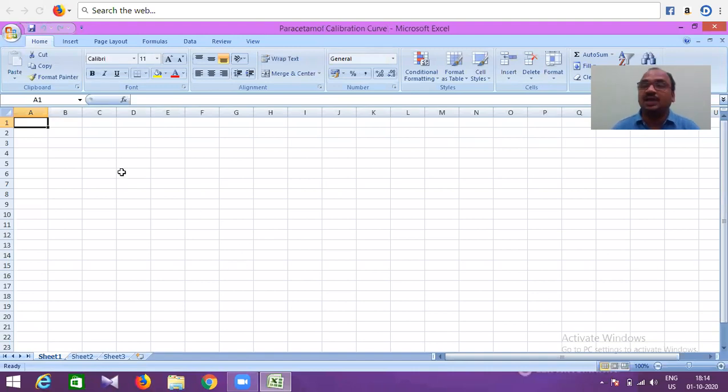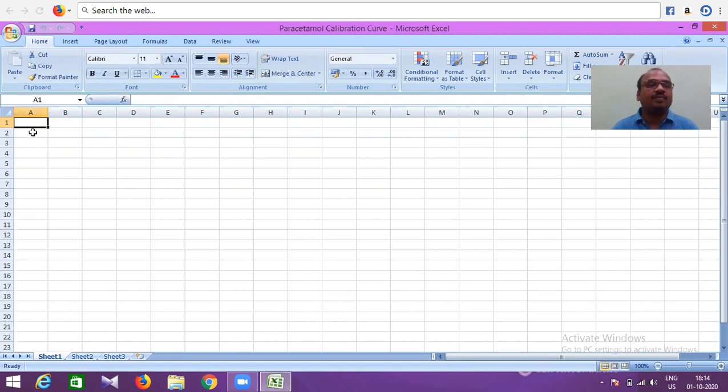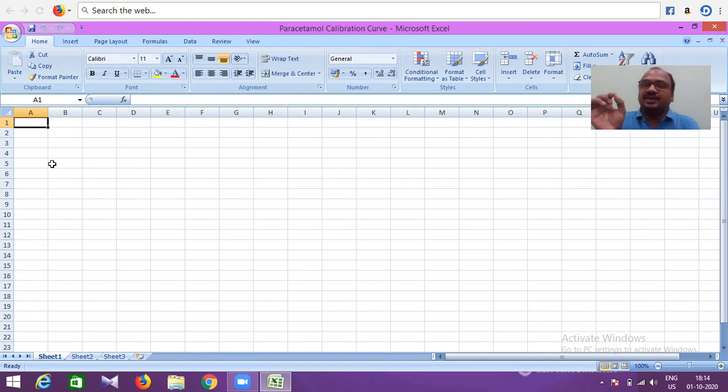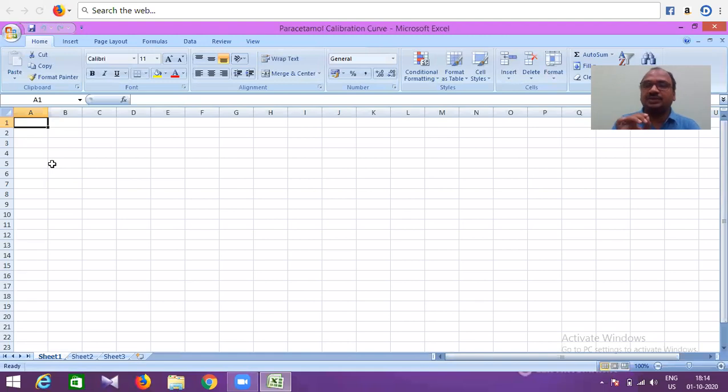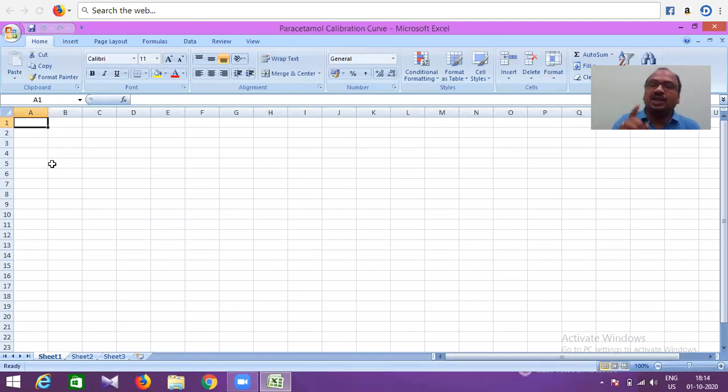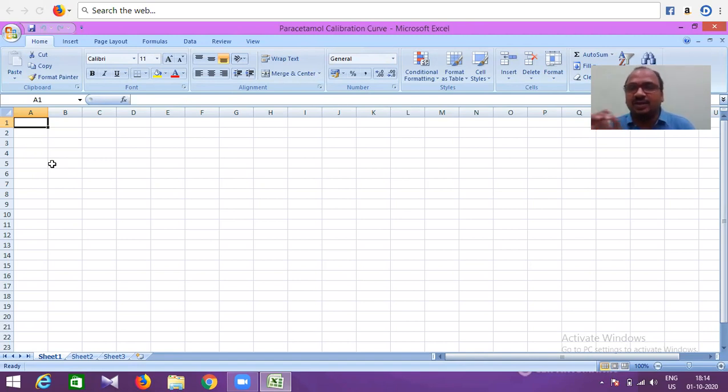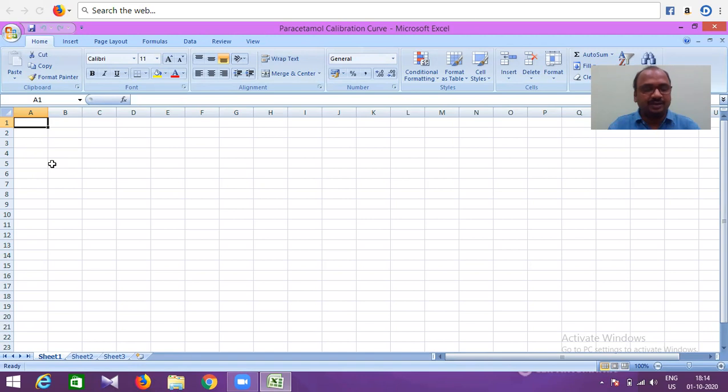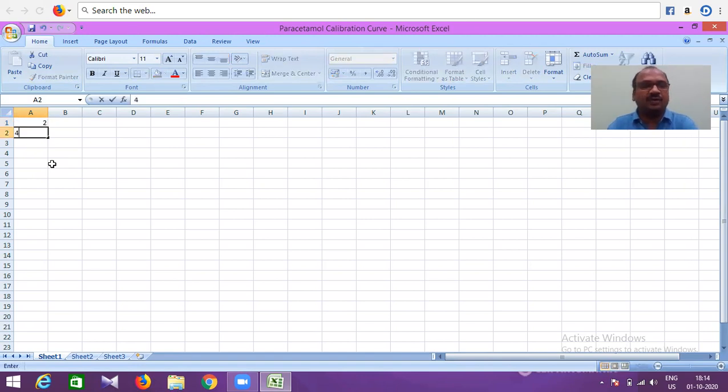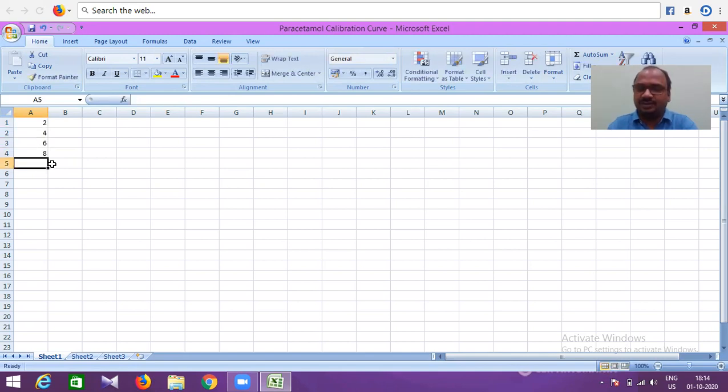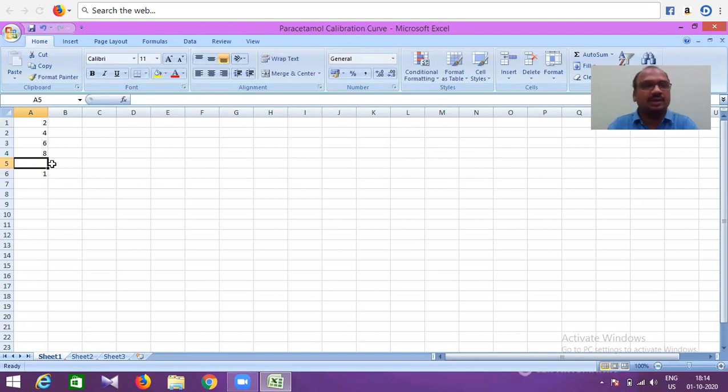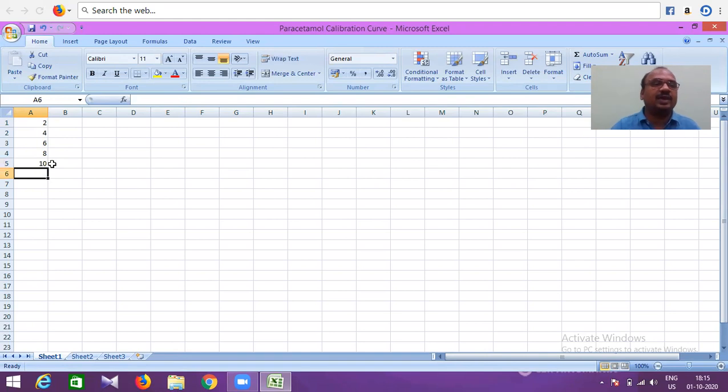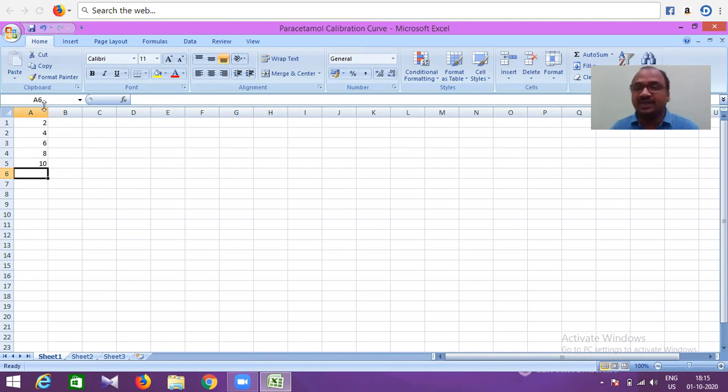I have data here. After opening, put concentration on X-axis. Don't write concentration and absorbance as headers yet. Just keep the concentration values first: 2 micrograms per ml, 4 micrograms per ml, 6 micrograms per ml, 8 micrograms, 10 micrograms. This is X-axis concentration data. I will type: 2, 4, 6, 8, 10. This is concentration in micrograms per ml. Here, only put the values.